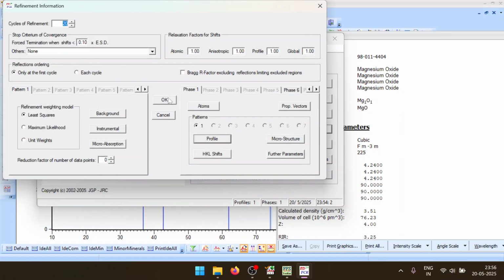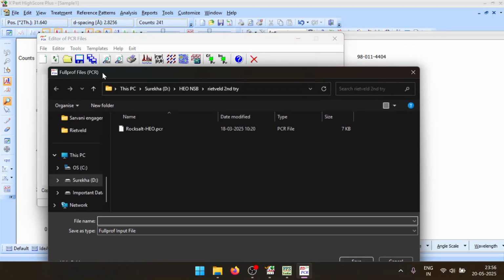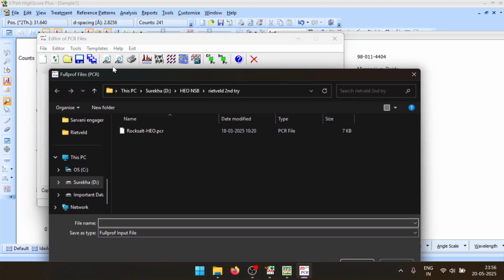Okay. Now you have done all these things. Your file is created. You have not saved it yet. This is where many times data is lost, or sometimes the file is corrupted. This has to be done very carefully. Just click on the triple save icon, Save data as. Don't click on the single floppy. Click on the 3 floppies.